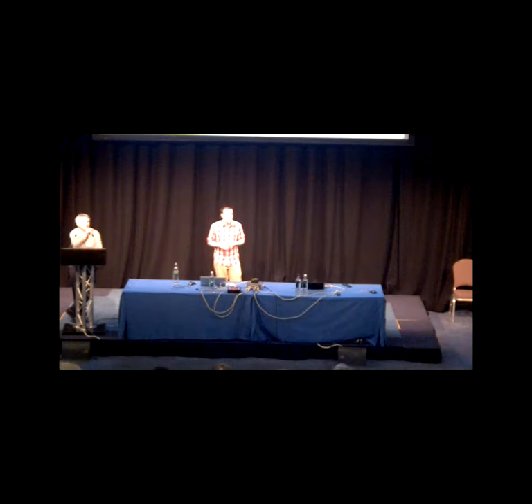Yeah, on the stairs there. Could you add extra energy terms representing data from other techniques like SAXS or NMR? Yes, that's actually in Rosetta, and I think all those cases would be straightforward. If you had multiple sources of density data, that would be a little bit trickier, but it's doable. All that should be workable in Rosetta. Getting the relative contributions of each might take a little bit of tuning to figure out how much to weigh one versus the other. But certainly a large number of those data sources are usable by Rosetta.